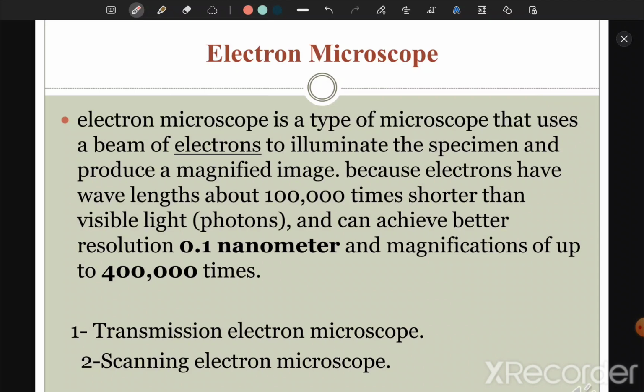Paraffin is like baking a cake: the oven is at high temperature, and later on it will be hardened. But the plastic resin, which is used for embedding in the case of the electron microscope, does not need the high temperature. This is the useful point. So you can keep many structures and many enzymes in your tissue sample as they are, and they will not be distorted during examination of the tissue.